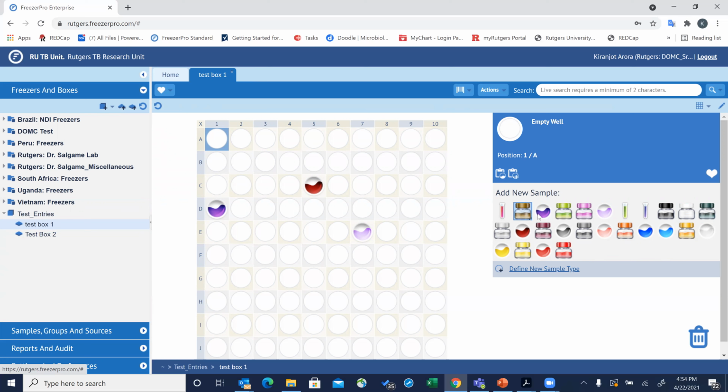They will only be able to see the samples that are specific to the FEN-TB adult protocol. So the icons, if you bring the cursors on top of these different icons, you will be able to see what the sample type is and which study it belongs to.